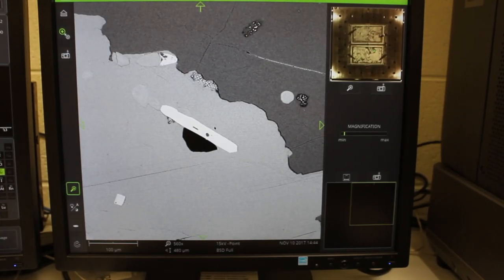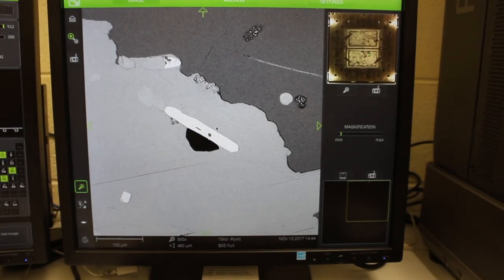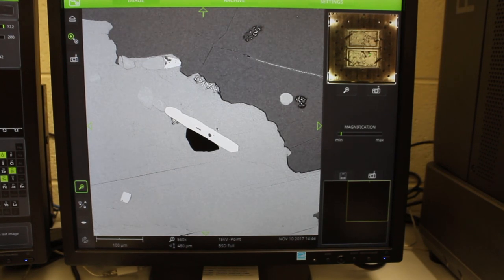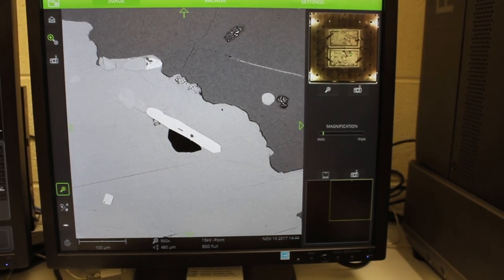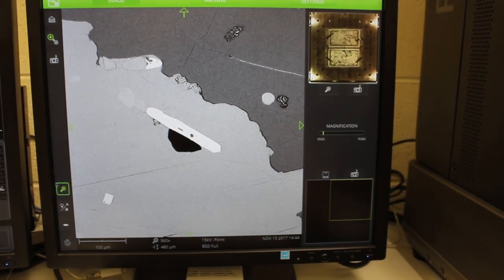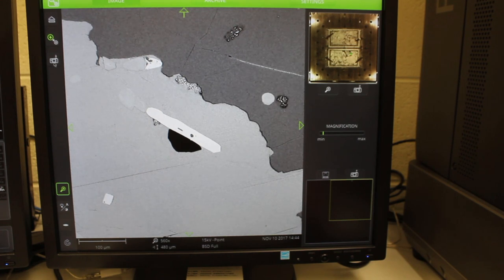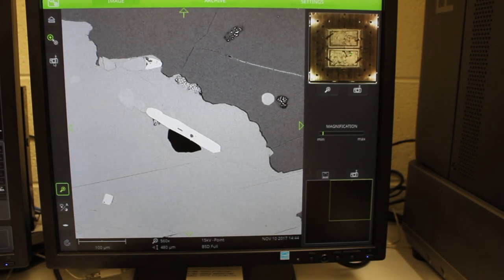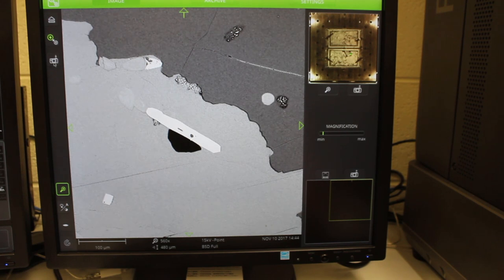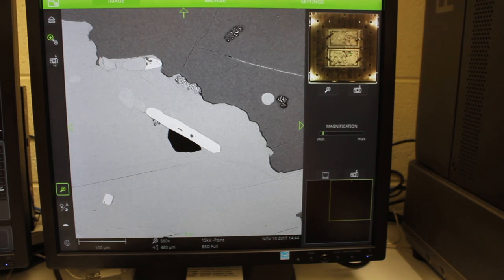To save your backscatter electron image, simply go to the camera icon on the left side of the screen and click it. This will save the image in the storage computer, which is to the left of this computer.